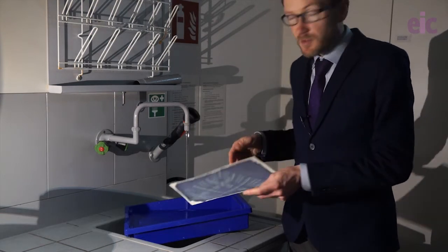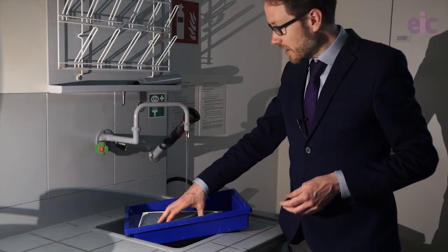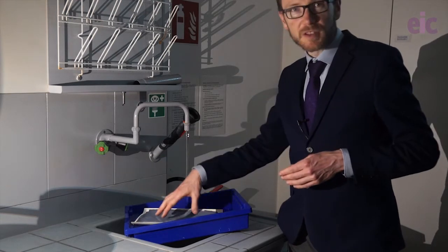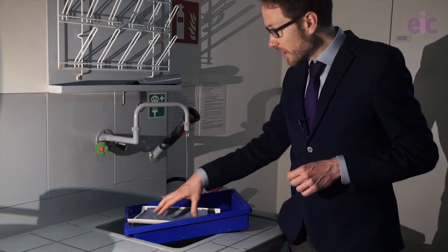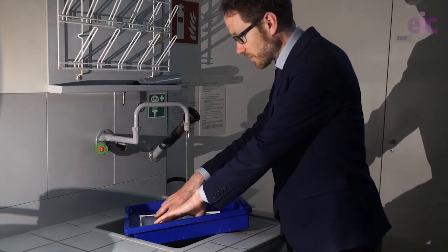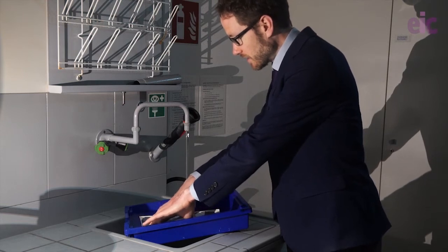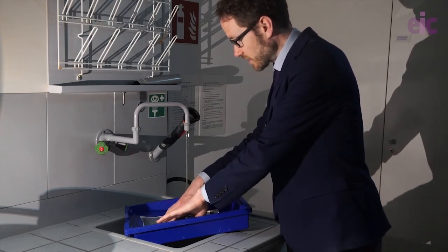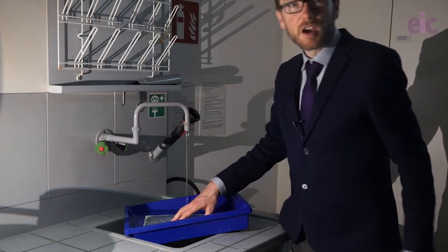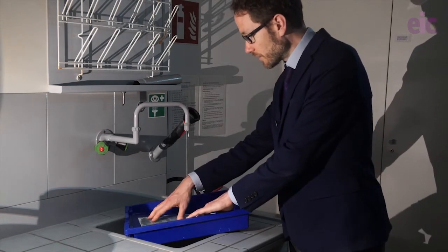So what we essentially want to do is just leave that rinsing for a couple of minutes. I find that a gratin tray leaning in the sink like this, so water can flow through the handle area, works quite well. We just want to make sure that we thoroughly wash away any of the unreacted starting material, and the image after that will be fairly stable for the long run.